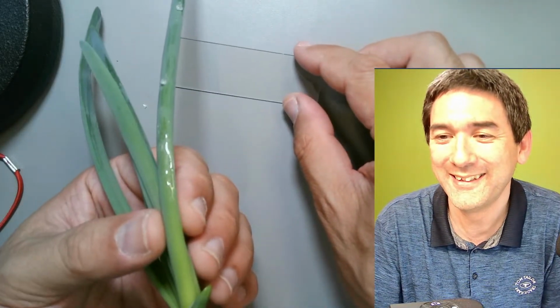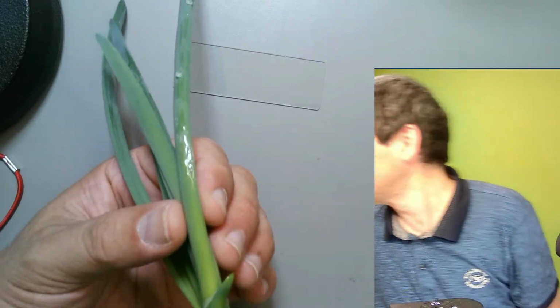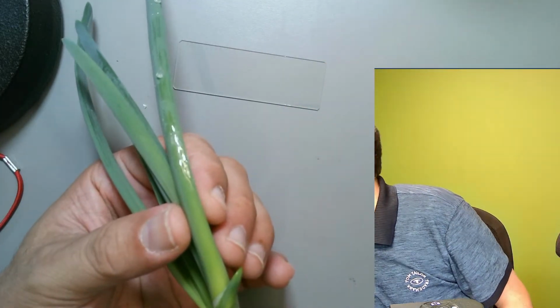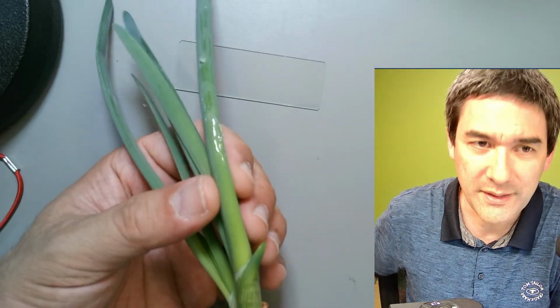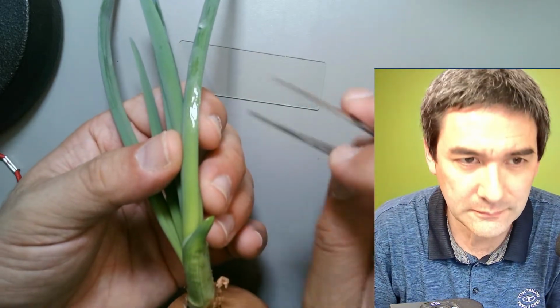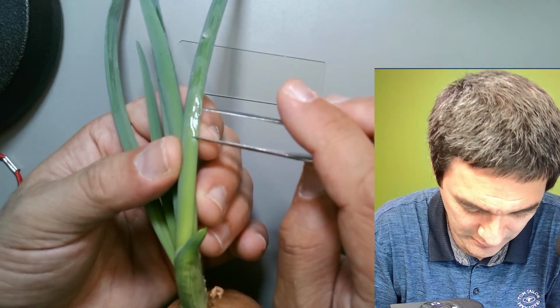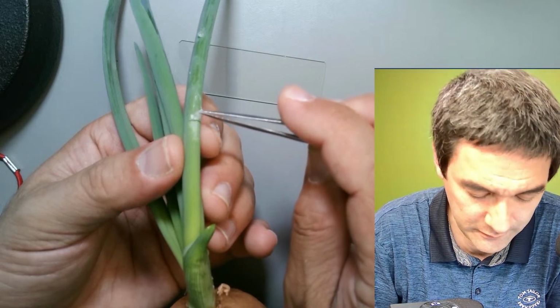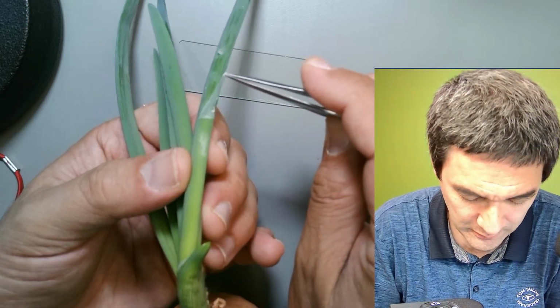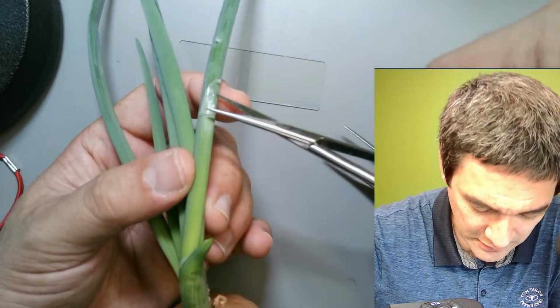Okay. So let's do the following. I need some tweezers. Okay, let's try this. Let's see if it separates even. So, you see the glue goes off. Okay, I'm just going to try to cut it off now.